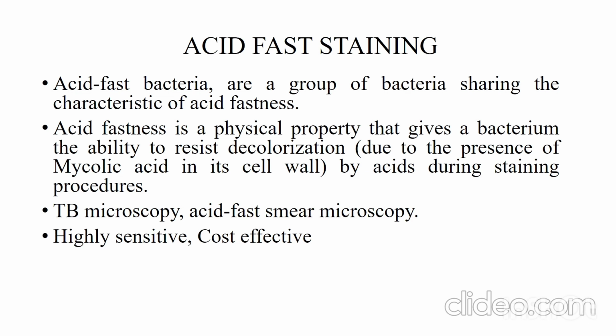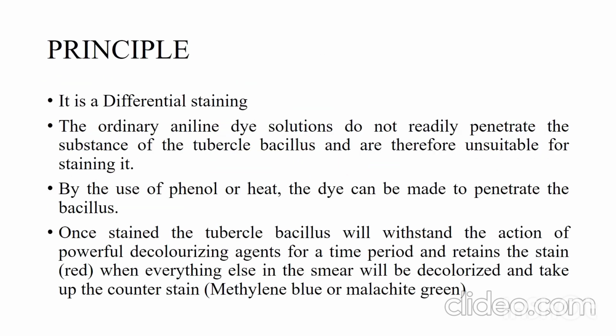Even though highly advanced molecular diagnostic tests have come into play, the value of this staining technique cannot be overstated, especially for low and middle income countries, because it is considered to be standard, highly sensitive and cost effective. The principle of this staining is that it is a differential staining.